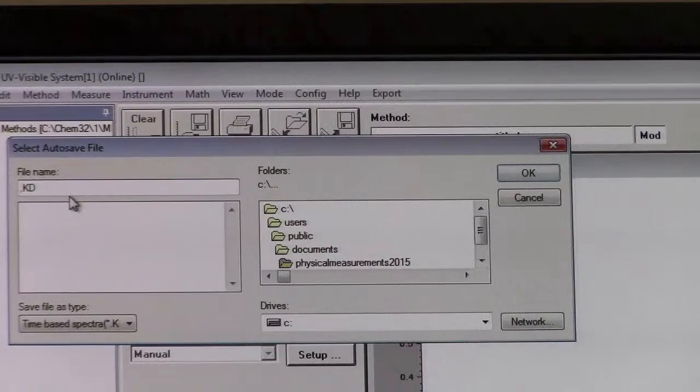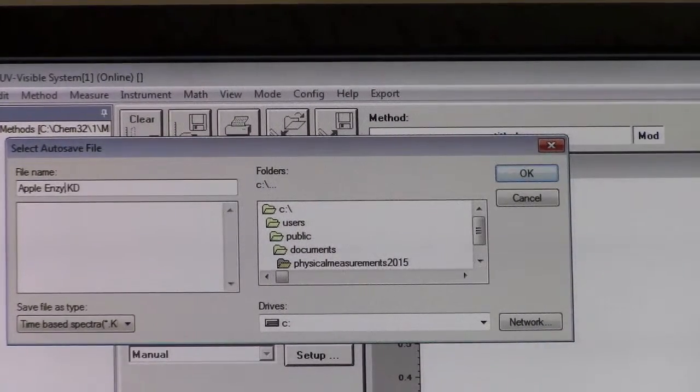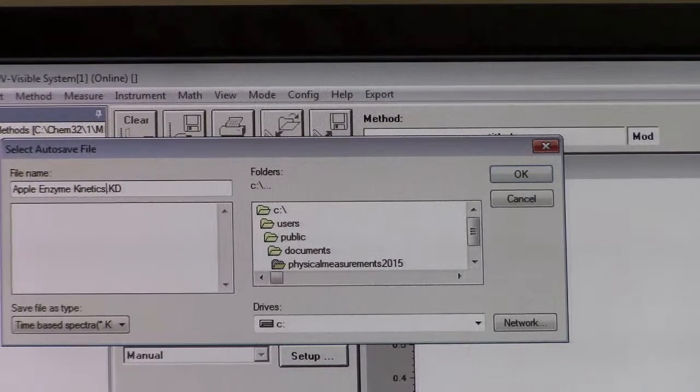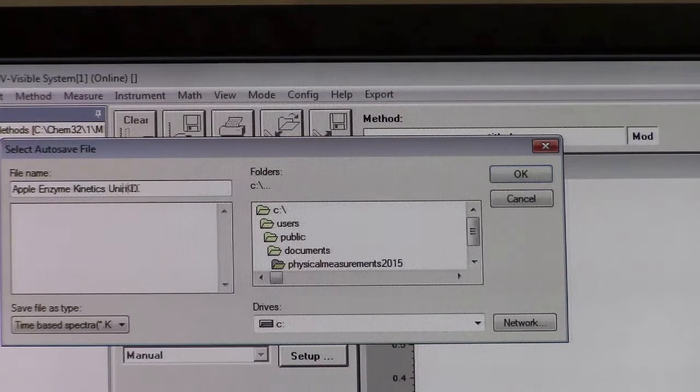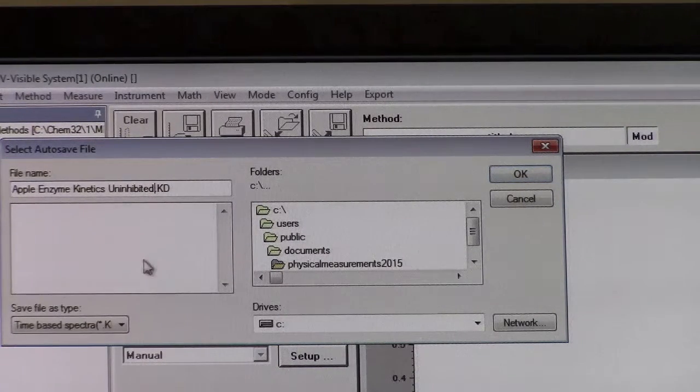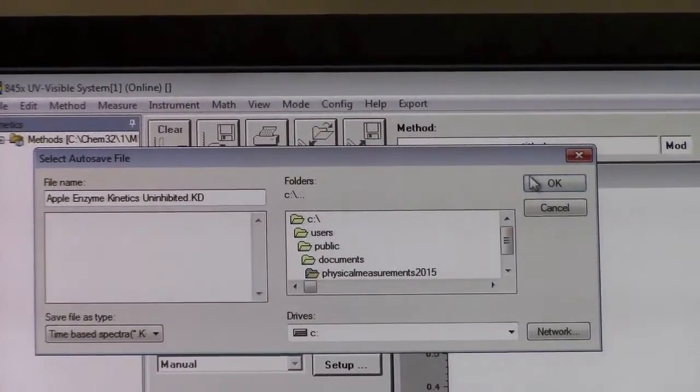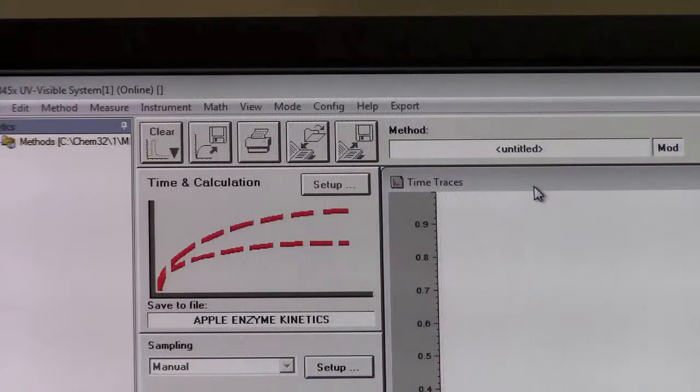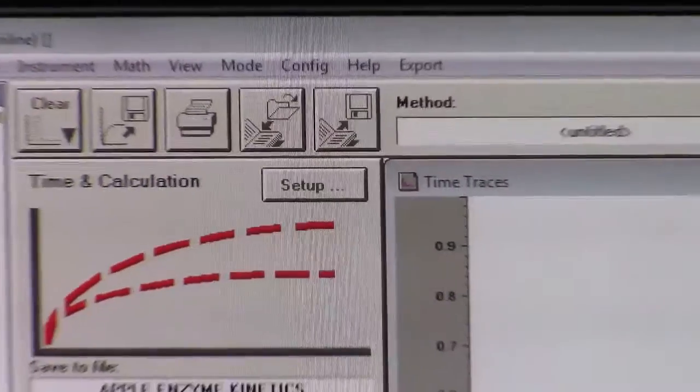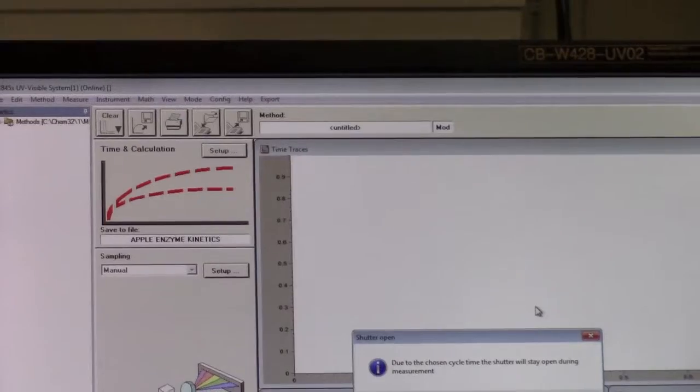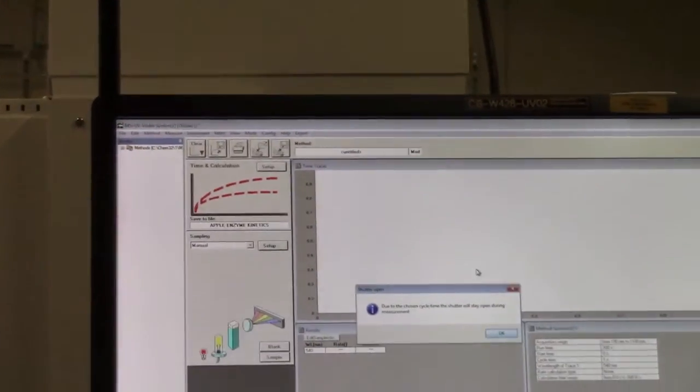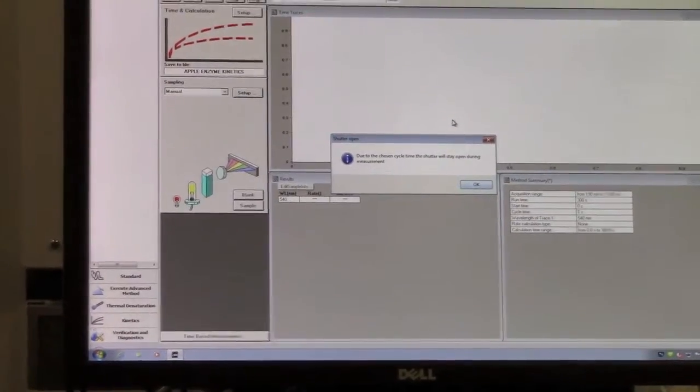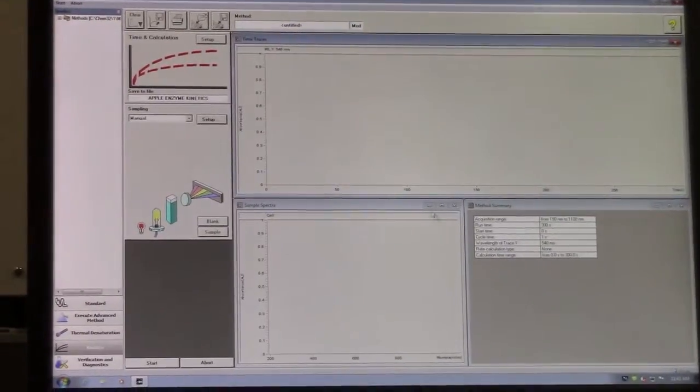For example, Apple Enzyme Kinetics Uninhibited. The file type is a time-based spectra type file, which is appropriate given the method. You'll be prompted that the shutter will remain open during the entire time due to the nature of the measurement and sampling frequency. Click OK to accept.